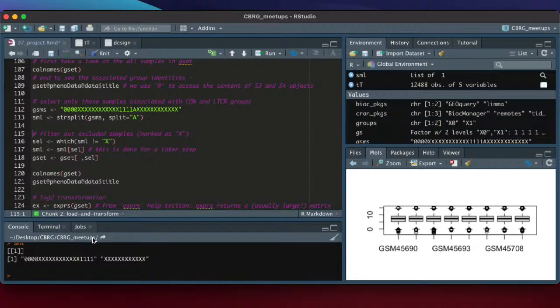This is why the tidyverse is so great, because you just deal with data frames. I have to confess, when it comes to lists and vectors, I usually try a bunch of things until something works, which is not a great thing to confess. But yeah, this kind of stuff is a little bit arcane.